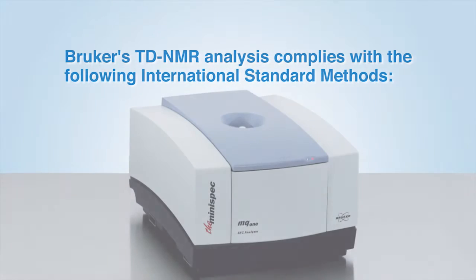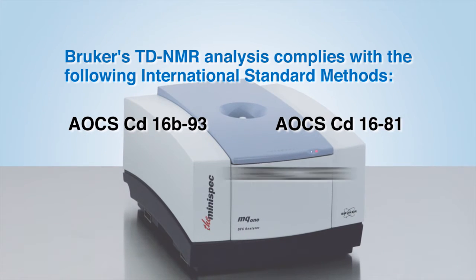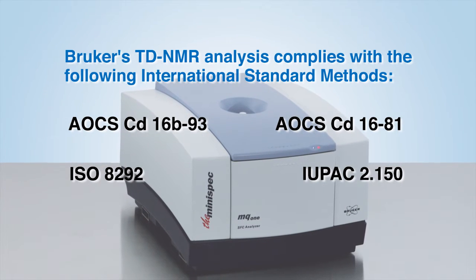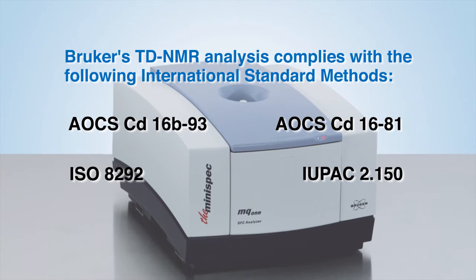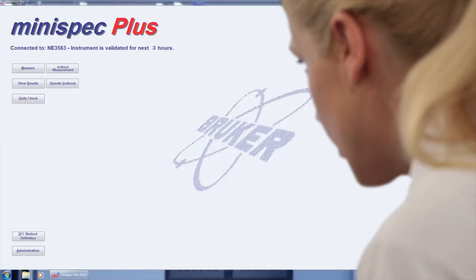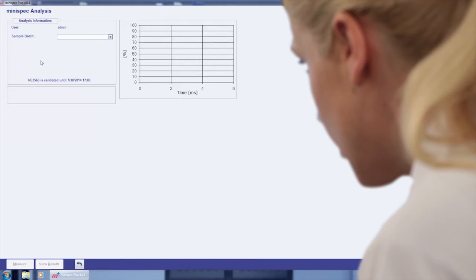The SFC determination of fats by time domain nuclear magnetic resonance analysis is the internationally recognized standard method according to AOCS, ISO and IUPAC. Bruker's MINISPECT SFC Analyzer supports both official direct and indirect SFC methods as well as parallel and serial methods.